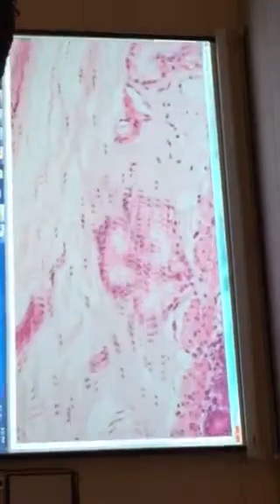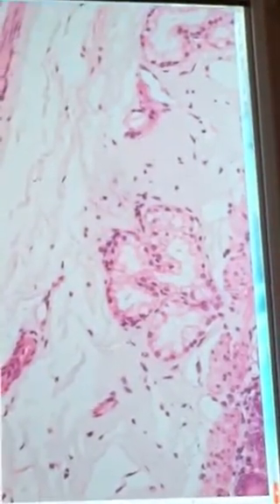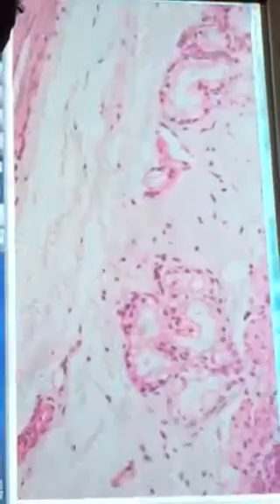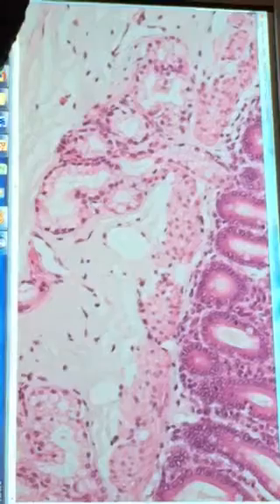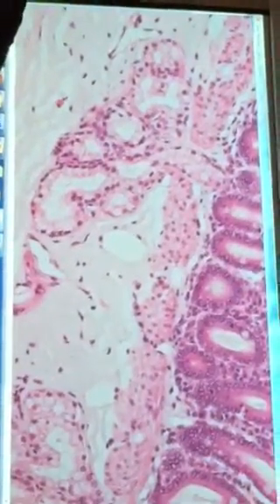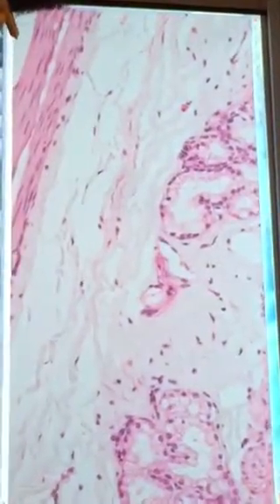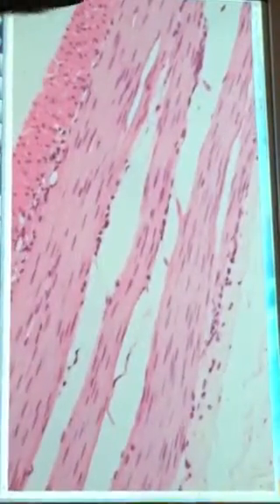All right, so then what's this structure here? The duodenal gland. Yeah, there's a couple other names for it. If you want to call it one of those other names, that's fine. Here's the duodenal gland. This also produces mucus. All right, so there's the submucosa. You can see that dense irregular connective tissue. And now we're down here in the muscularis externa.